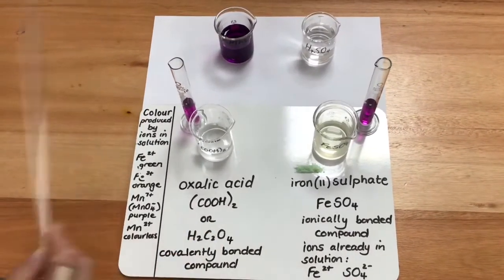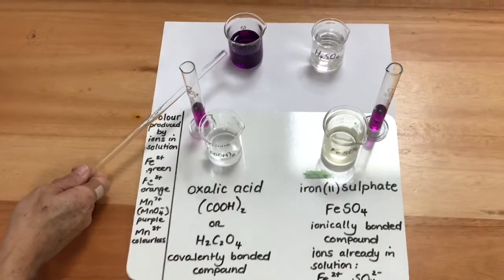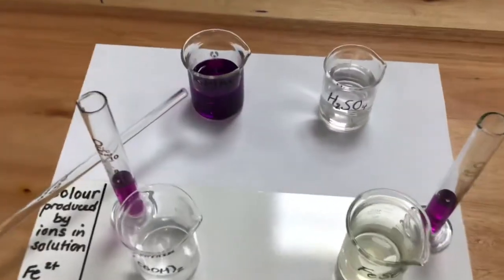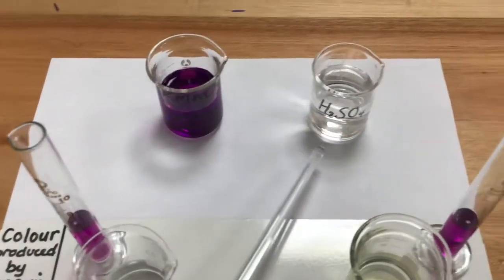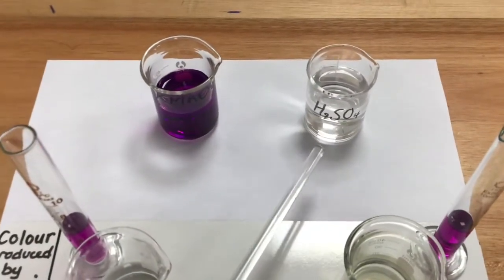This purple solution that I have here is potassium permanganate, KMnO₄, and then I have some dilute sulfuric acid at the back here.